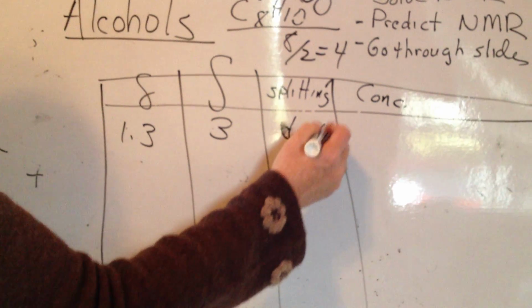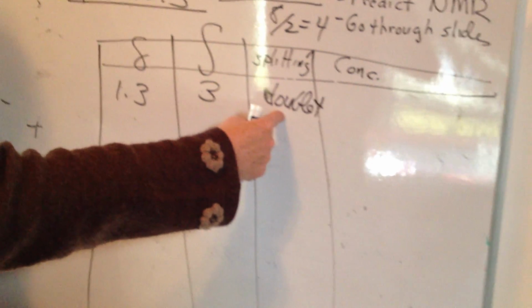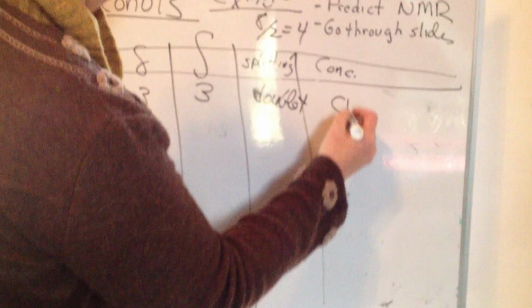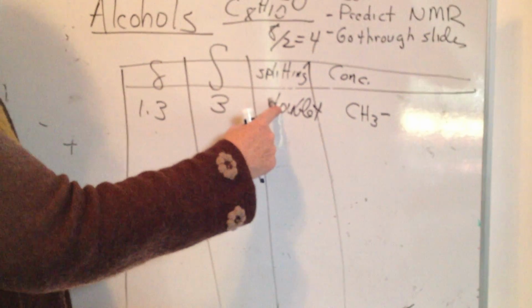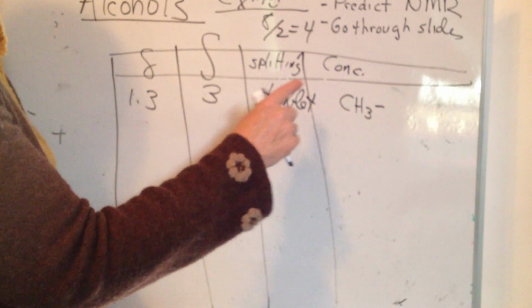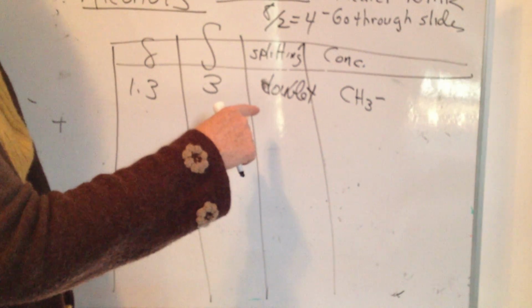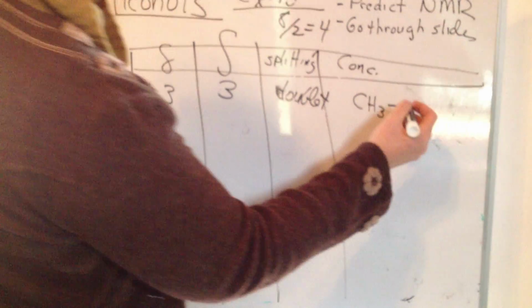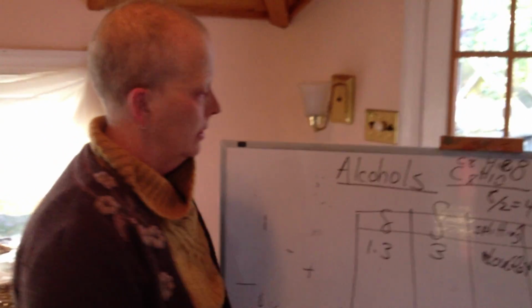So let's review what this means. What this means is you would interpret this. This is what is here. This is what is near, right? What is here are 3 identical hydrogens. This would be a CH3 group next to a doublet, okay, which means the fact that there are two peaks means that you have one less hydrogen neighboring than the number in the doublet. So you subtract one from this, and you would say it has one neighbor. So this is very likely a CH3 group next to a CH. Now, if this is really the case, we'll be able to corroborate this down the line.